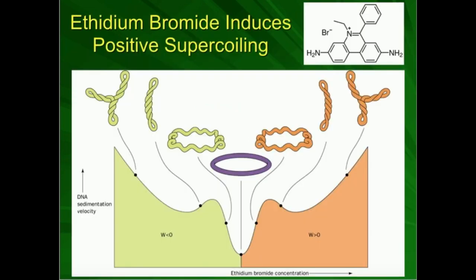When you think of a relaxed DNA molecule, you should think of a molecule that looks something like this, okay? However, either something like this or something like this is highly supercoiled. So this purple DNA strand, and by the way, all of these are the exact same DNA strand, circular DNA, but the same DNA strand.